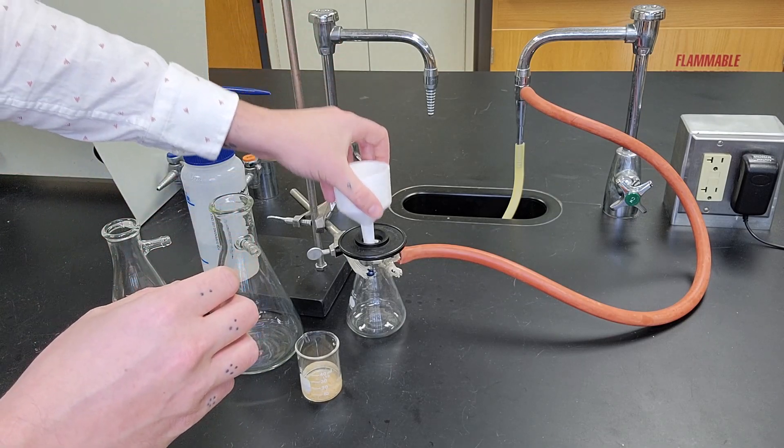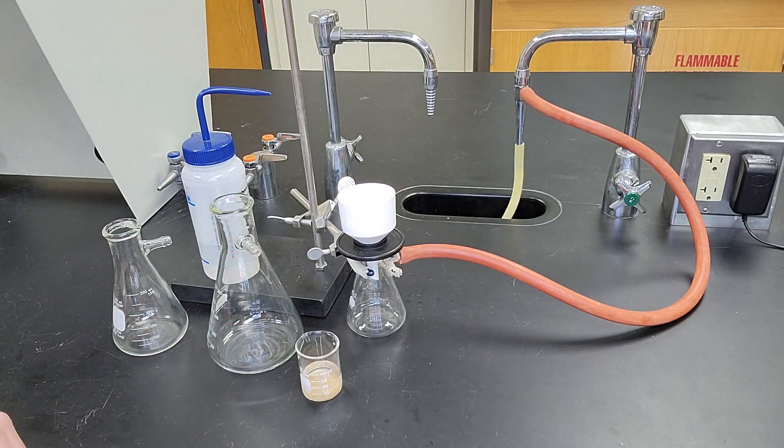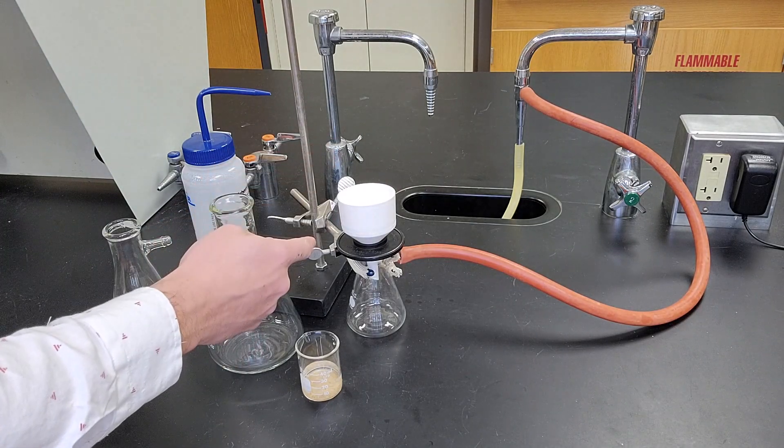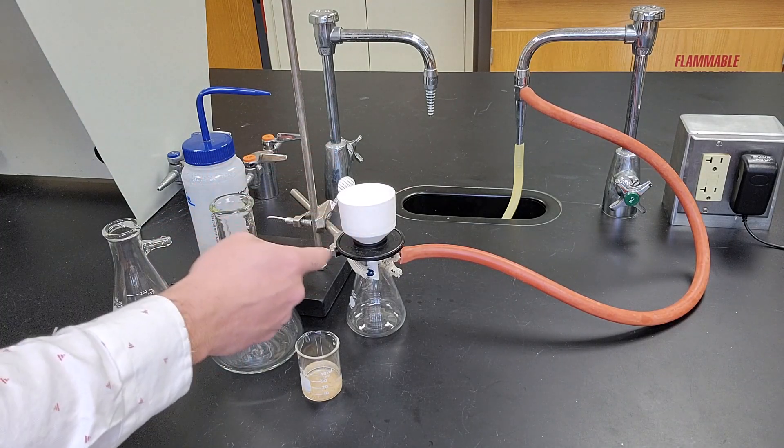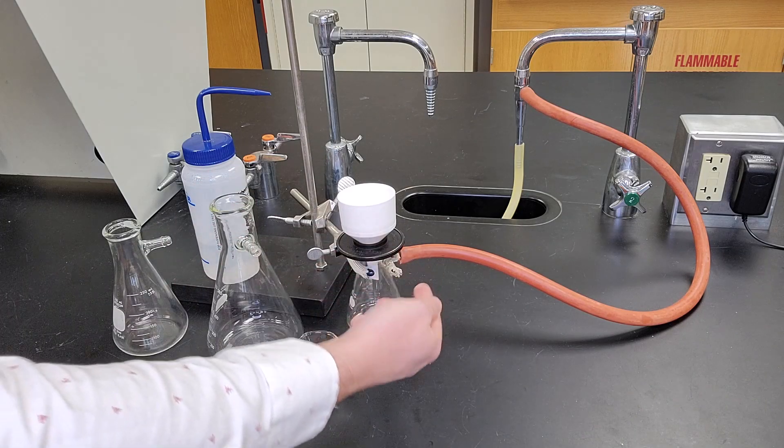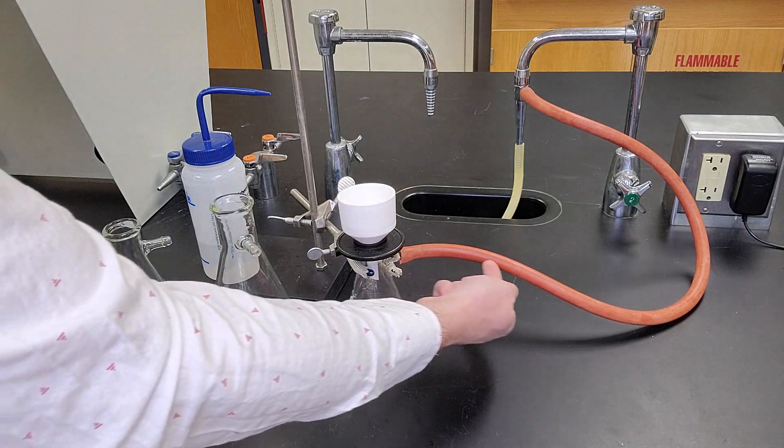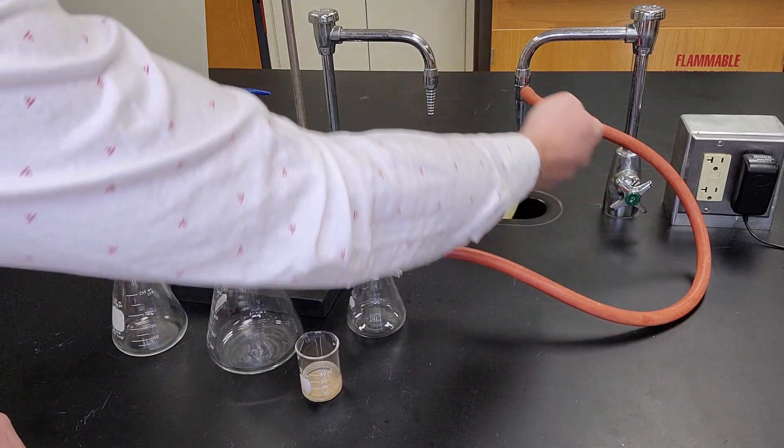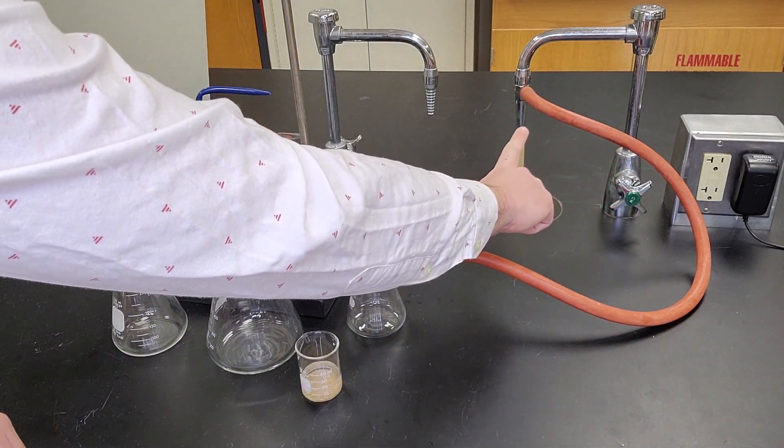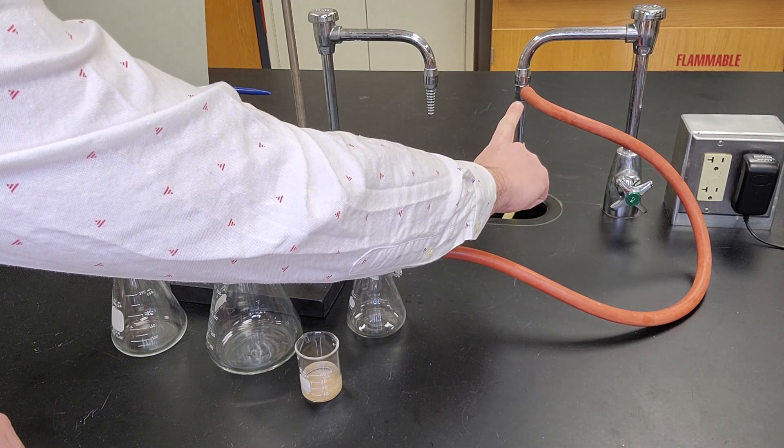This sits on the top like so with the filter paper inside, the rubber ring to create the seal, and the sidearm flask on the bottom. I've already attached the hose that connects to the sidearm on the sink. The sidearm on the sink is what's going to create the vacuum.